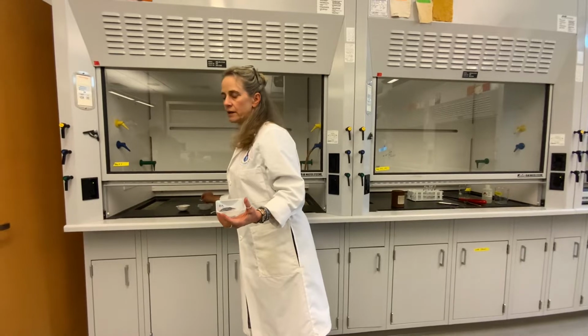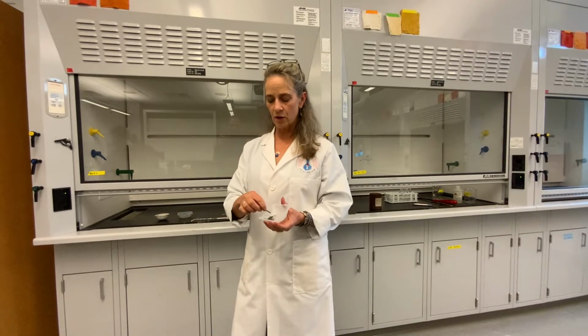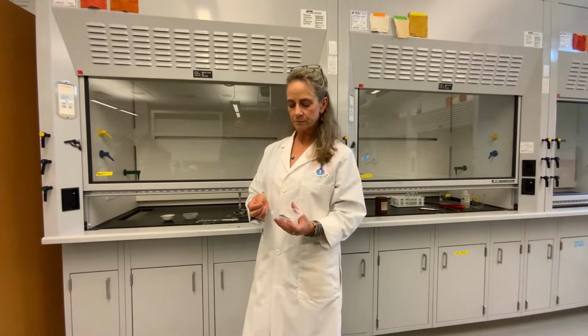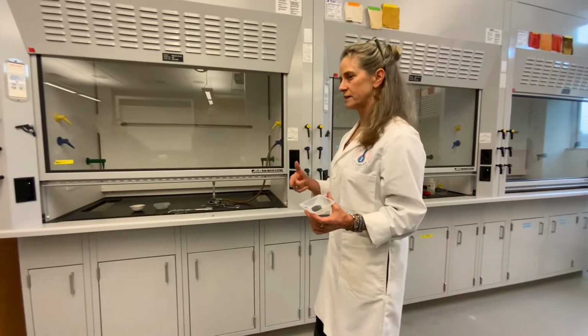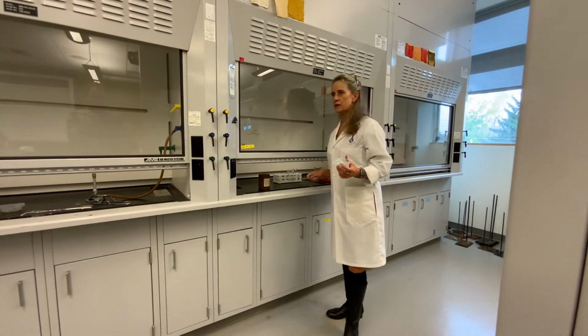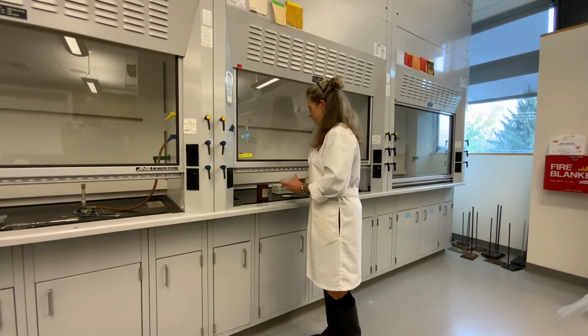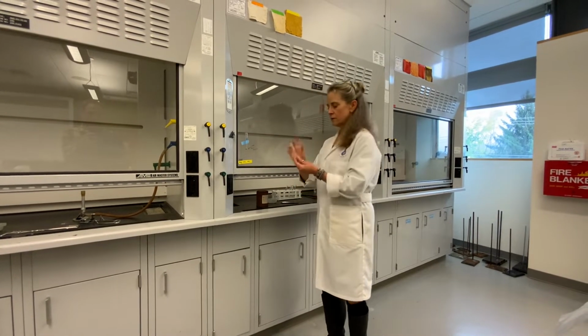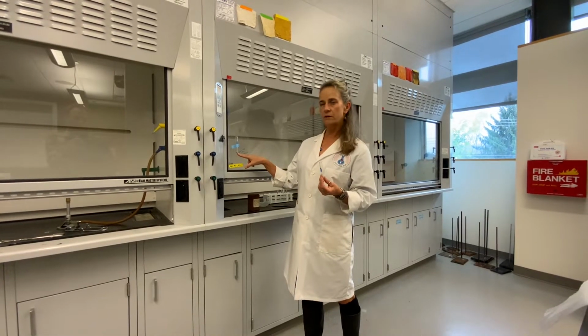So I encourage you guys to check this out, right? You're using the same metal. This is magnesium in a strip, and this is magnesium, we call it granular, right? But this is the same metal, so make sure you're observing those properties, so that's something to write down in your table. Okay, so here you're going to use another different type of spatula, okay? And in this test tube right here, you're going to put a little bit, and it shows you how much right there. So not very much.